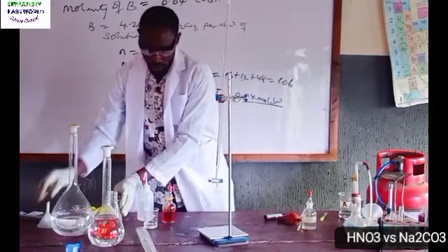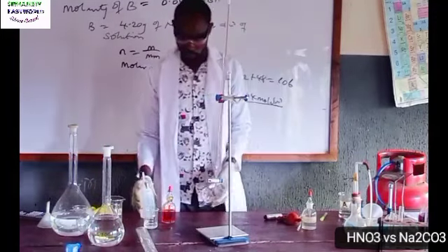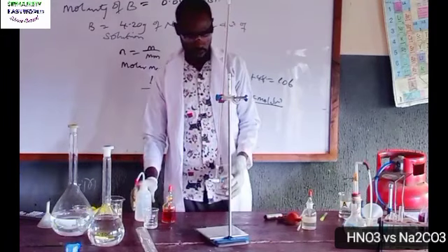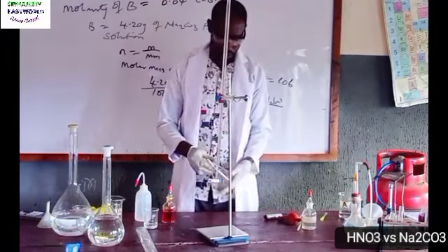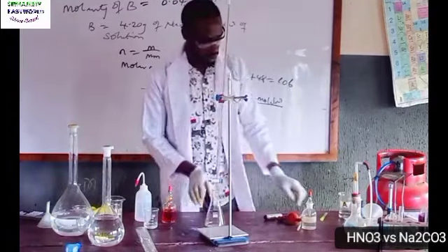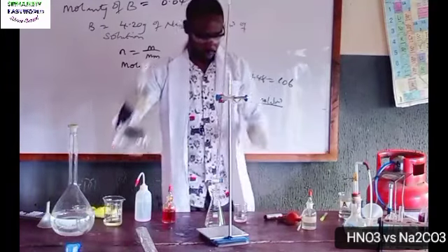So this time around, second titration, my initial is 0. Rinse with distilled water. This is my base. I need more base.